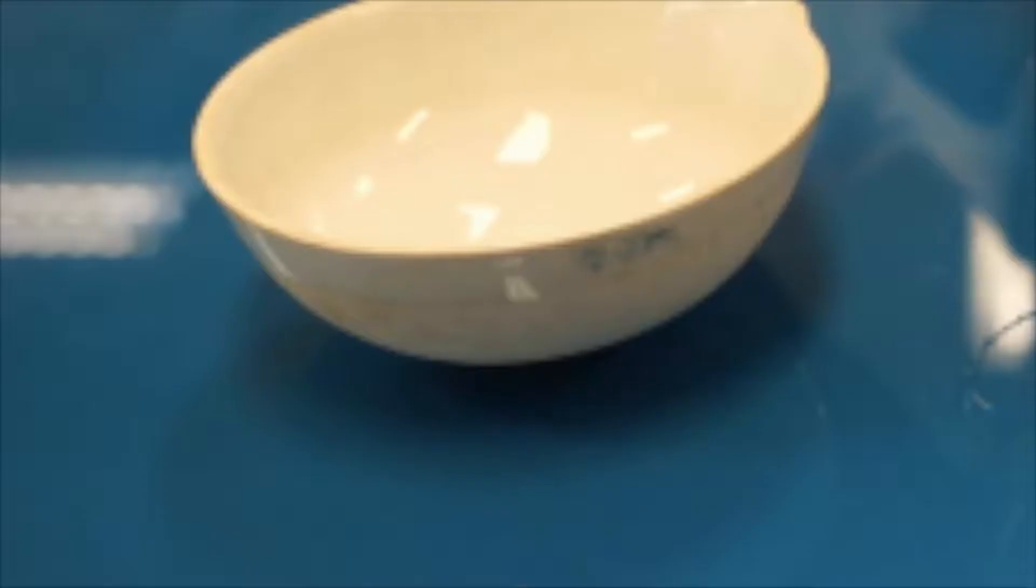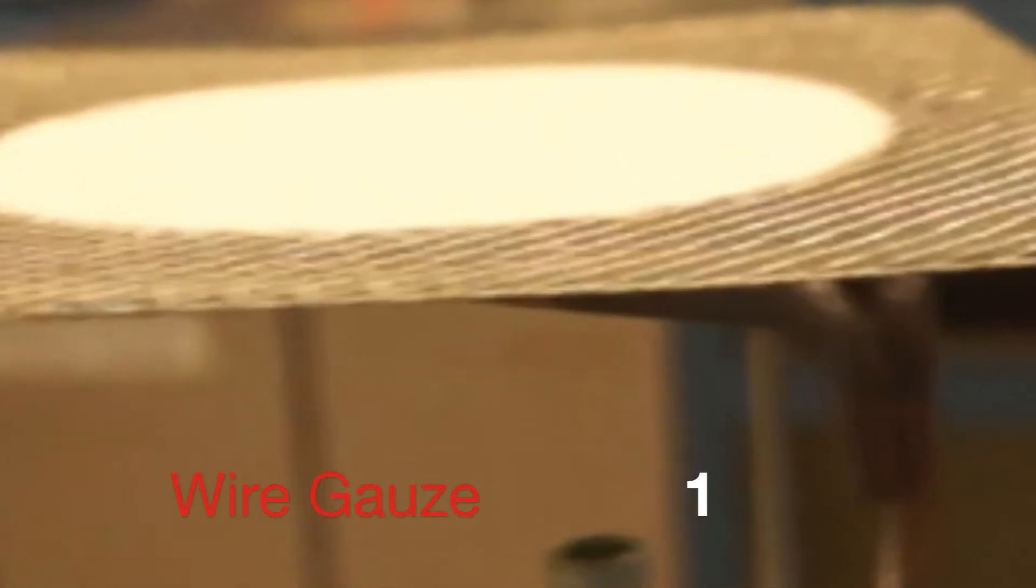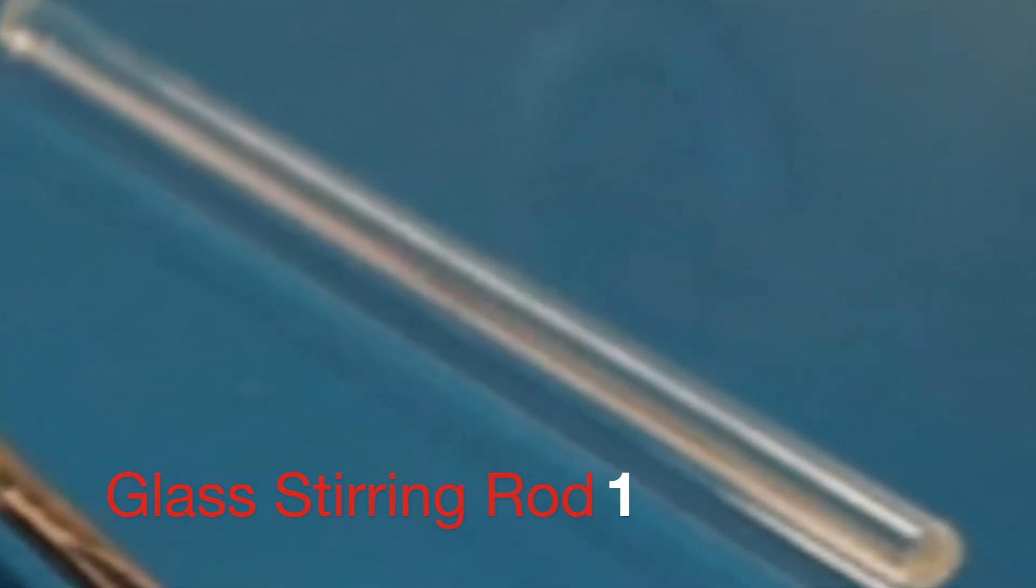Hey viewers, No Minds on Chemistry here. Today we are going through the separation technique Evaporation to Dryness. We will need a tripod stand, an evaporating dish, a wire gauze, a Bunsen burner, and a glass stirring rod.